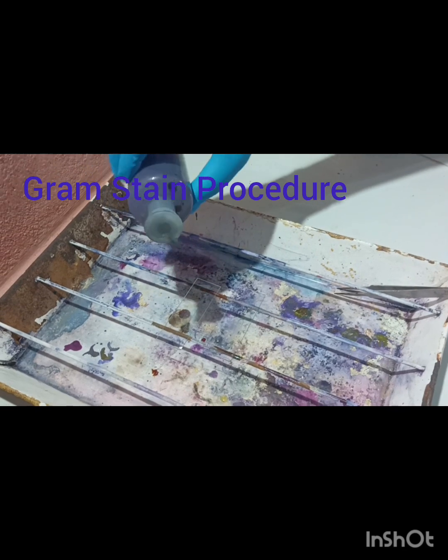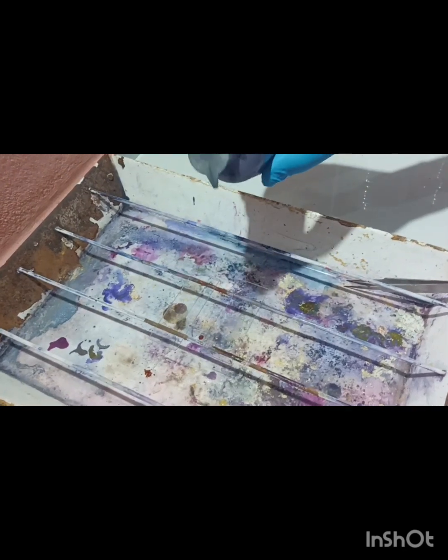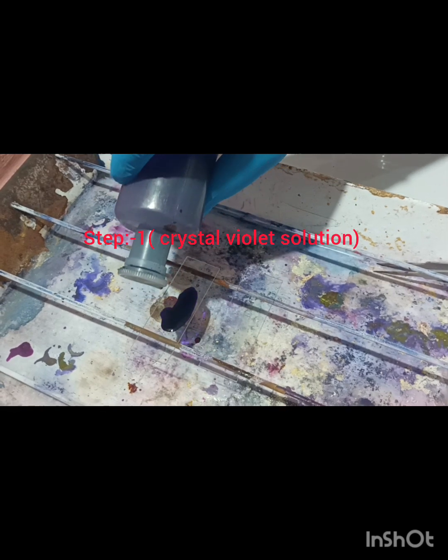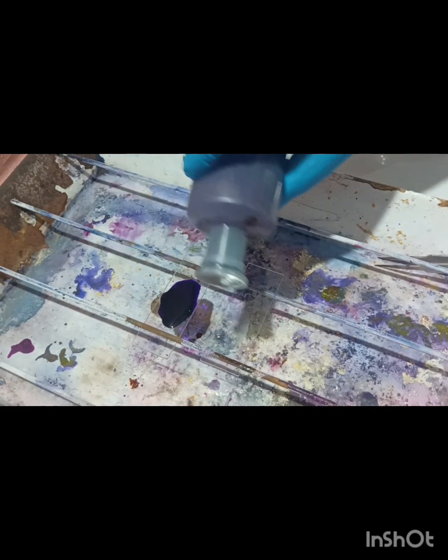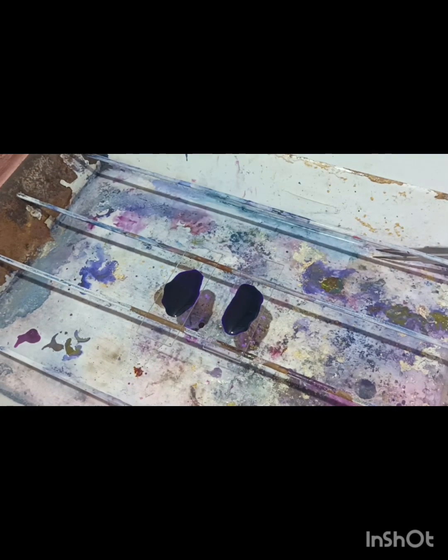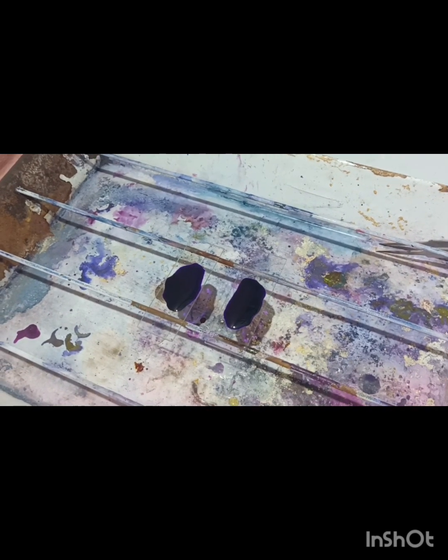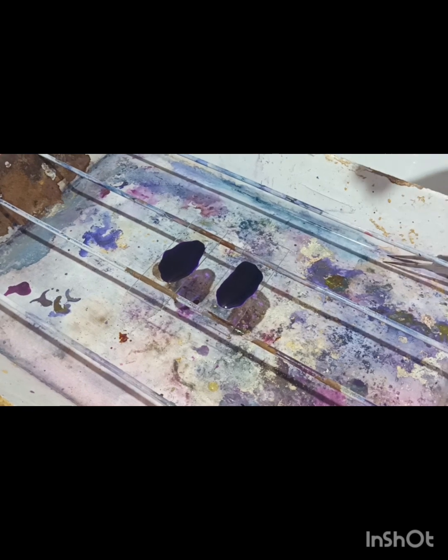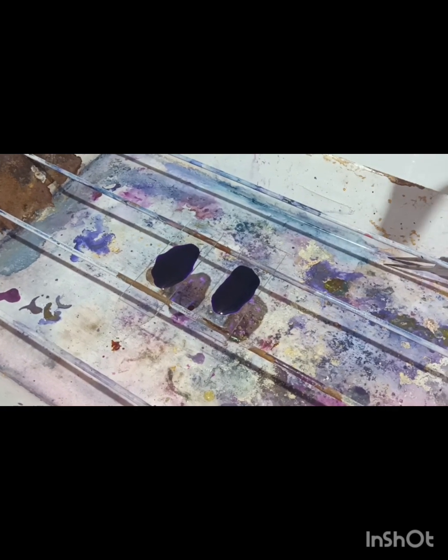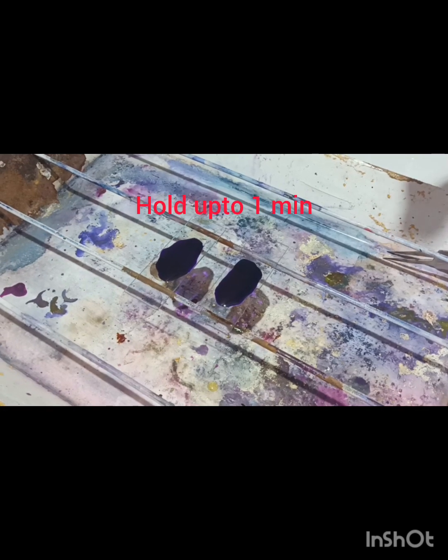We are performing gram stain. So first step is we have to cover the whole smear area with crystal violet. After crystal violet solution, we have to hold it for 1 minute.